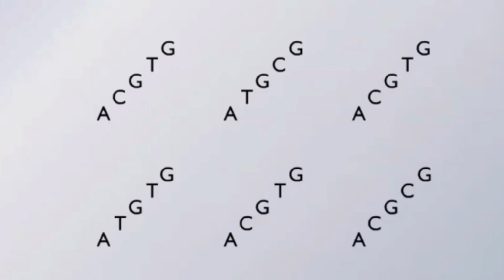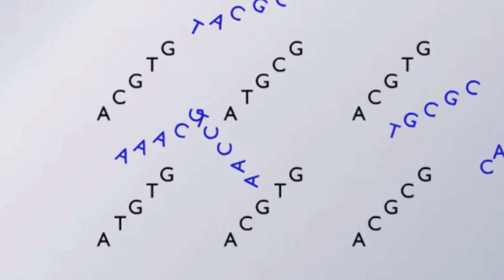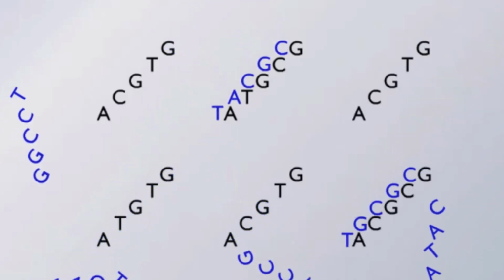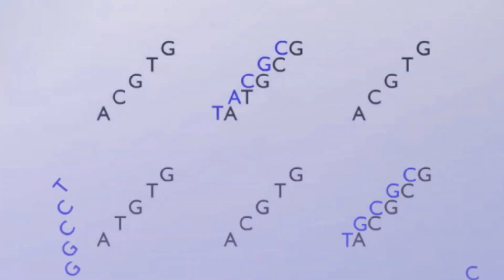The DNA from the organism being studied is isolated, fragmented, and tagged with a fluorescent dye. The DNA fragments are then incubated with the chip. DNA from the organism that is complementary to the DNA in the microarray binds together and the unbound DNA is washed away.